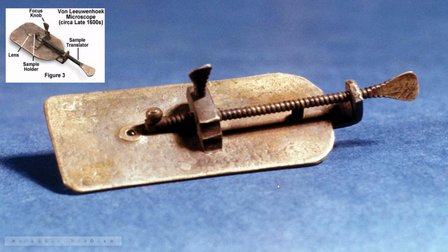So things that were too small to see with the naked eye, with just your eyes alone, you could gather a sample, put it over this little thing called a lens. The lens would bend light a certain way and then allow you to see a larger image of what was there. So you could actually see cells with this little microscope that you could hold in the palm of your hands.